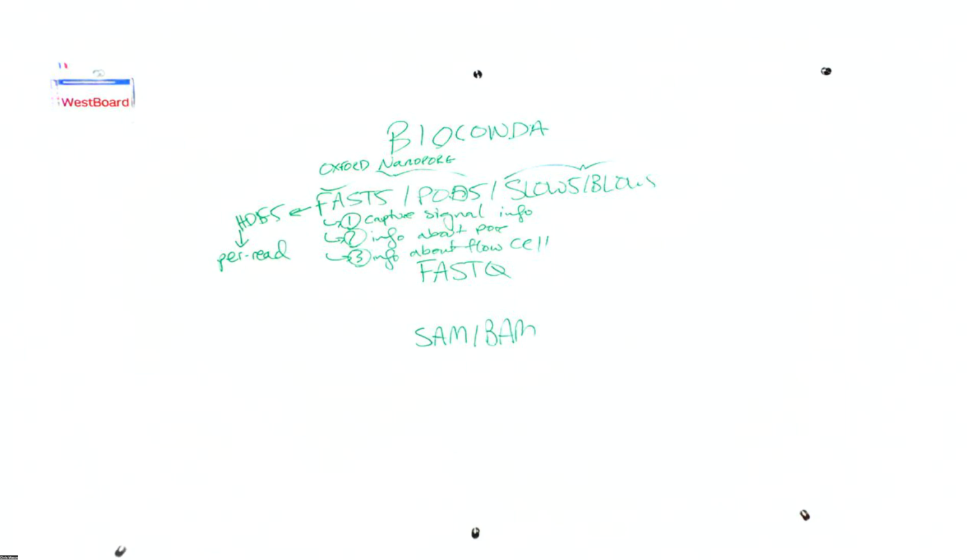And so if you go back to 2017, 2018, Nanopore was actually outputting sequencing information in FAST5 files that each contained a single read. So if you had 1,000 reads coming out of a sample, you had 1,000 FAST5 files. Now the FAST5 format that they use is analogous to multi-line FASTQ. So one FAST5 file can contain all of the reads, but organized pretty much in the same manner.